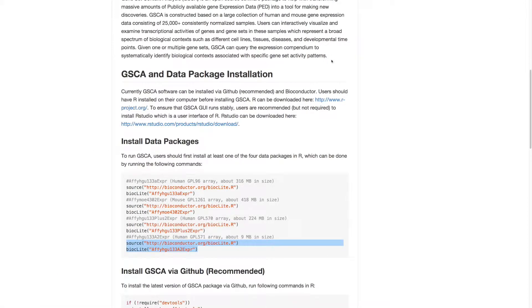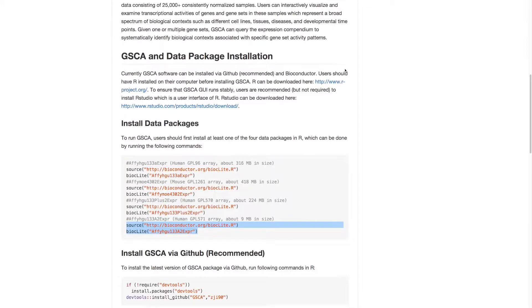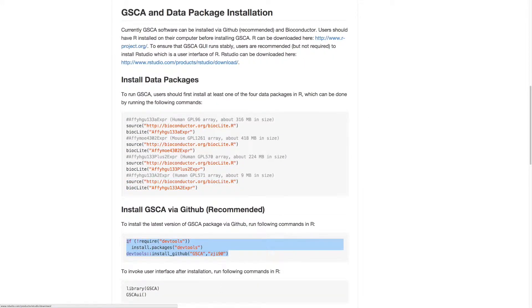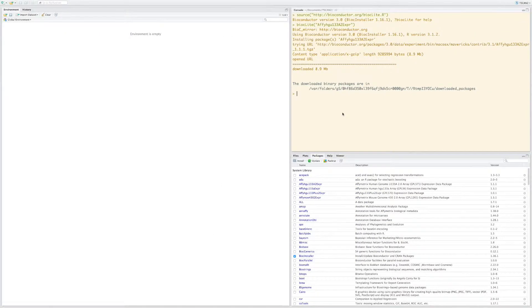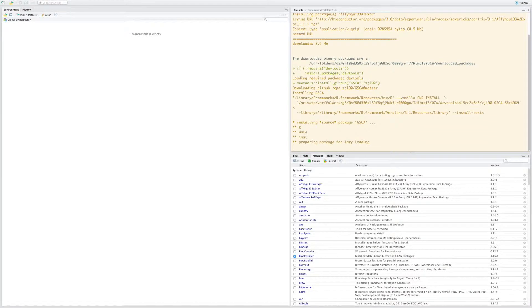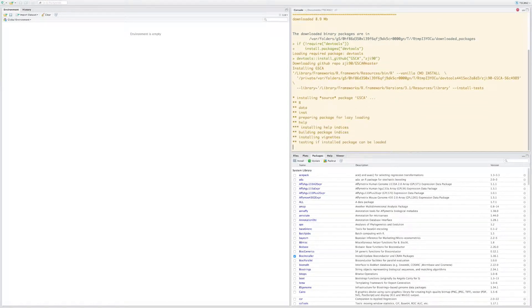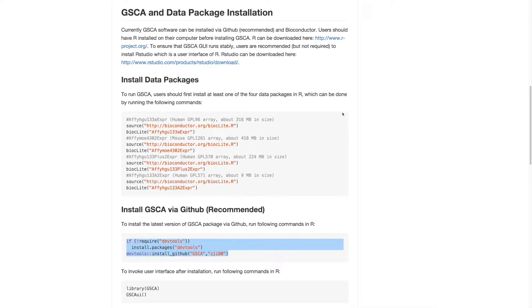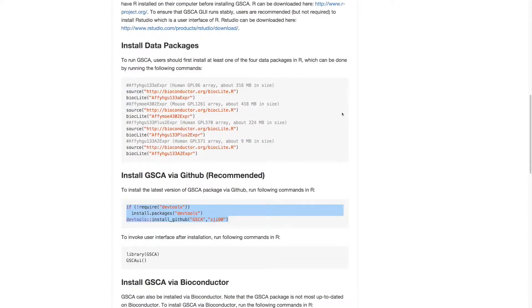The GSCA package can be downloaded and installed from GitHub by running these commands in R. After installation, the GSCA user interface can be invoked by running the following commands in R.